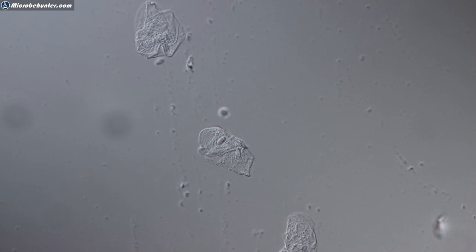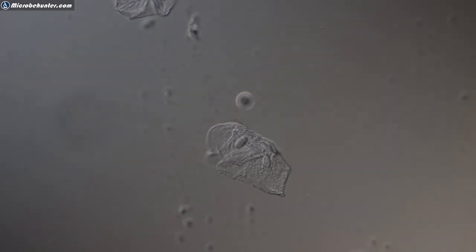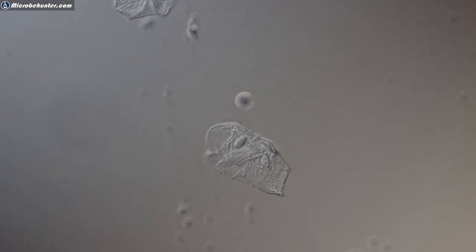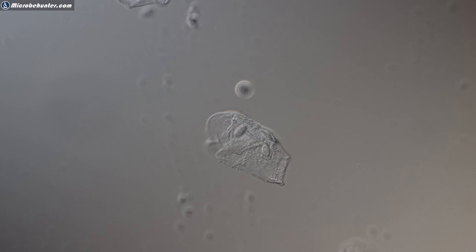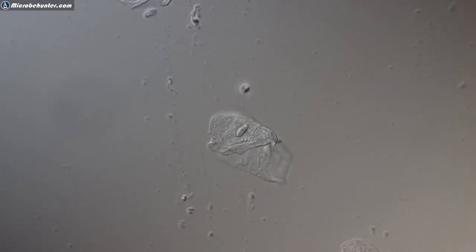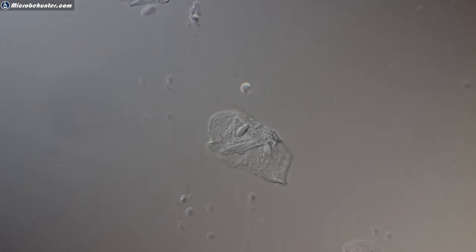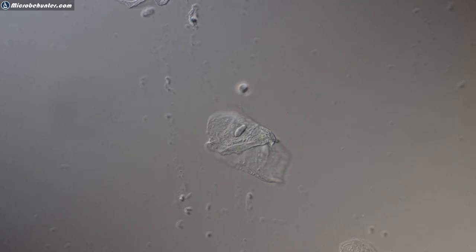For the fun of it, let's go up to the 60 times objective. And of course, I need to increase the intensity a little bit again. So I'm opening up the condenser, as a matter of fact. And that's how it looks, okay? You see, I'm focusing back and forth. And I can actually also rotate. There is a ring to rotate on the 60 times objective to adjust for the thickness of the cover glass. So I'm just now rotating the adjustment ring on the objective. Okay, there's not so much of a difference.